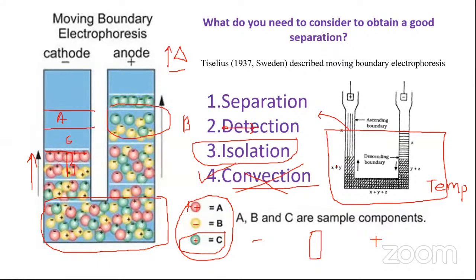If you try to aspirate this, you will actually be aspirating everything out. So instead of getting separated X, you will get a mixture of X and Y. Do you agree? You'll have to aspirate it out, right? There is no kind of outlet here so that you can collect X as it comes out. Do you agree with this point?